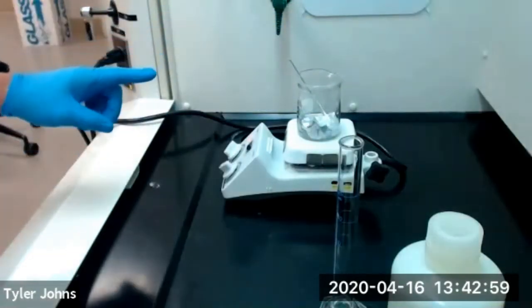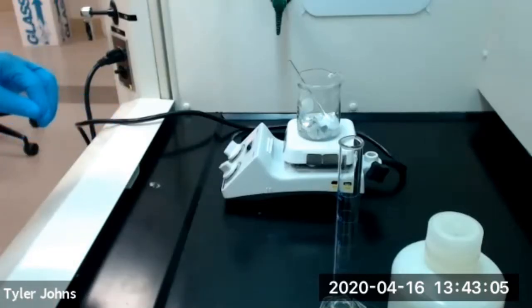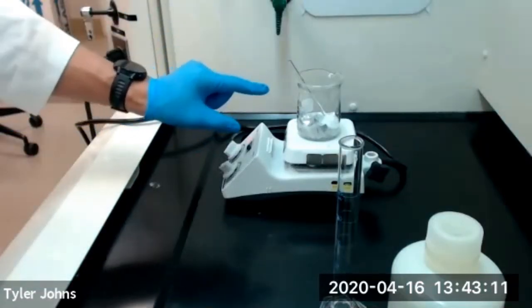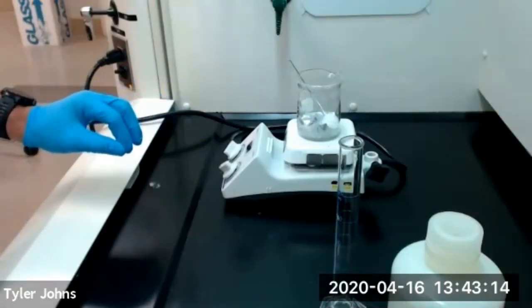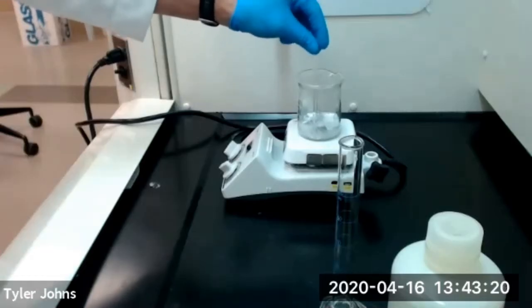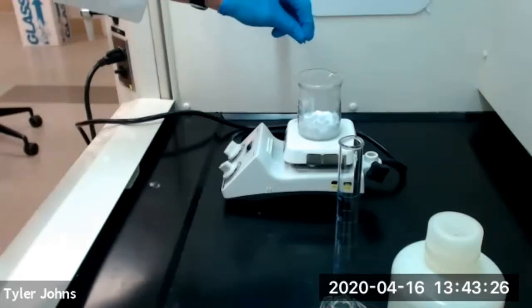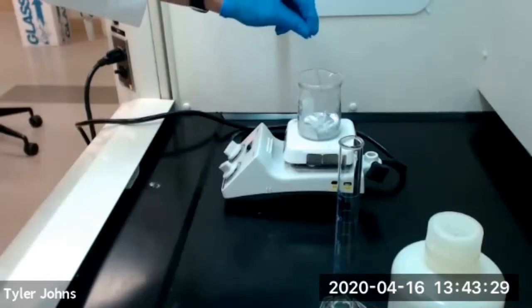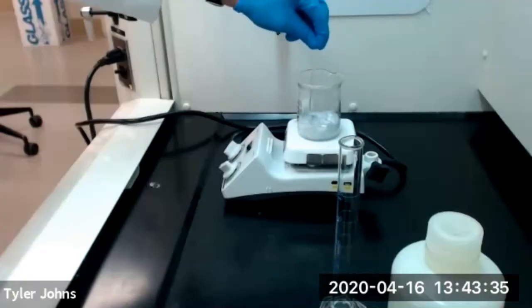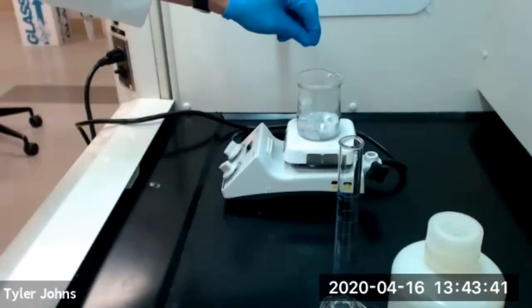So as this heats, it's going to take about 5 to 10 minutes for the aluminum to dissolve, except for maybe some small impurities. And then we will continue heating until the volume has reduced by about 25 to 50%. I don't know if you can see now, but we are getting some fizzing with the potassium hydroxide and the aluminum foil. And we do this step in the hood because it's evolving hydrogen gas. So we're going to go ahead and continue to let this dissolve until all of the aluminum foil has dissolved in the potassium hydroxide.